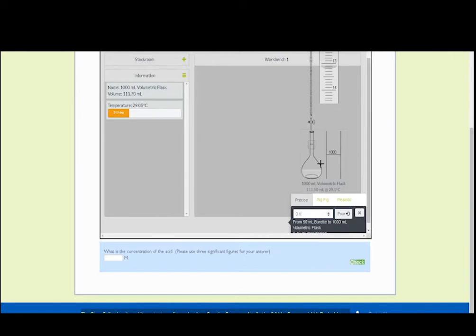So this is just not turning pink, so it looks like we're going to be pretty high up in the value. We're just going to keep adding. I think we're probably going to be there sometime soon. Okay, there we go.